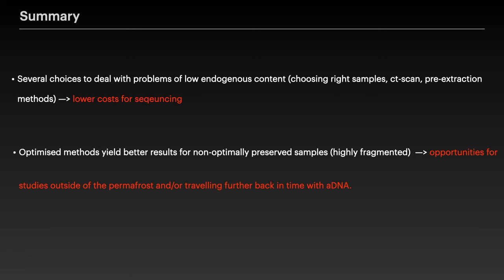By applying these methods, we can have the possibility to study species that died far back in time, or that lived in habitats outside of the permafrost. And this is actually what we do.